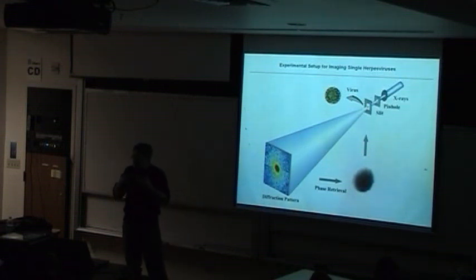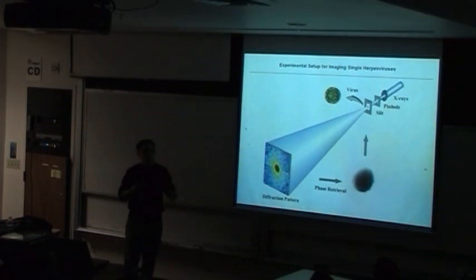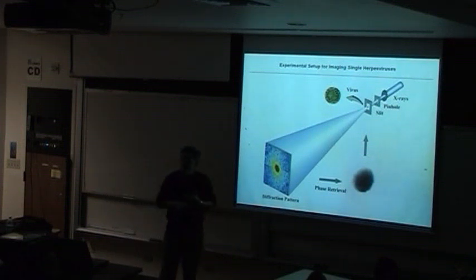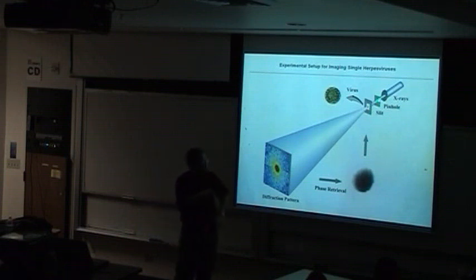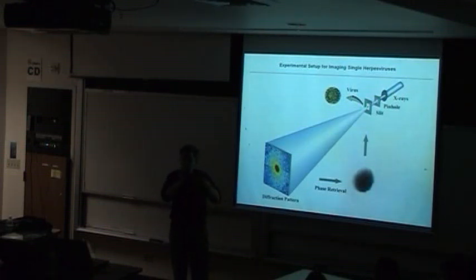We tried to see what resolution we can get at a synchrotron with a single virus. So we tried a virus. This is herpes virus, and it's about 200 nanometers. We put it on a silicon nitride membrane, and the X-ray comes through a pinhole. It's a very difficult experiment because this pinhole is 20 microns, typically the diameter of your hair. You have to align the diameter of your hair to a 200 nanometer virus, everything in the dark, completely in a box.